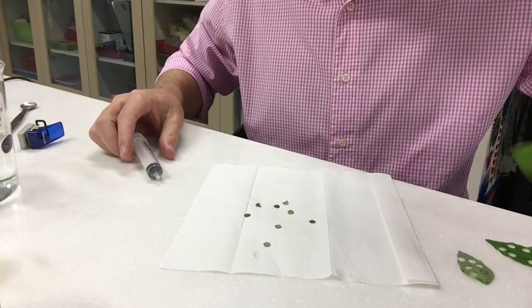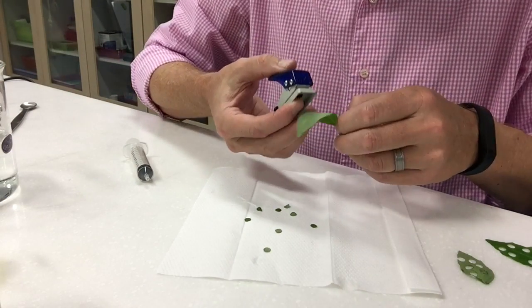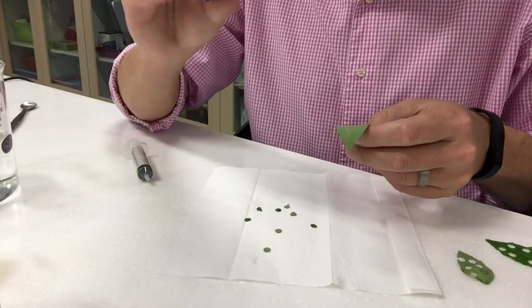And then of course you need leaves. Now I've gone ahead and punched out a number of discs already just using a hole puncher.